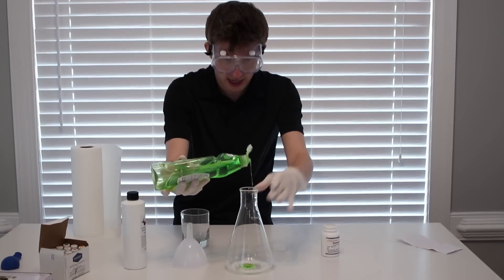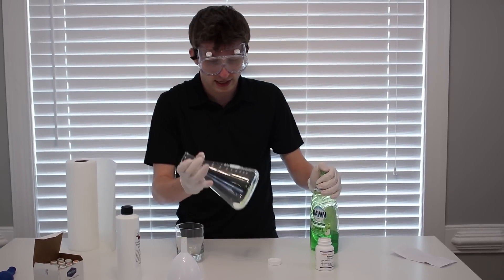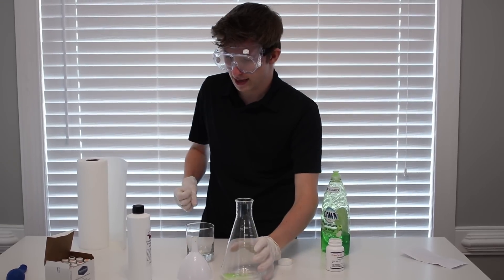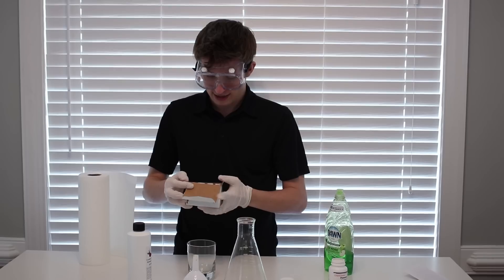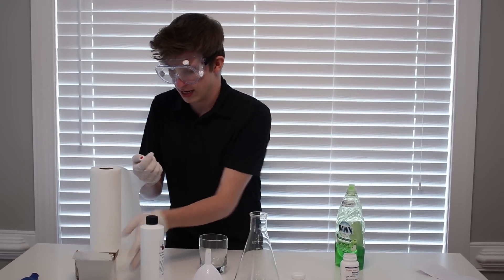I honestly don't know what this reaction is supposed to be. So there's the soap. Kind of mix that around, there we go. So that's all mixed in right there. And we're going to go ahead and add some food dye. Let's do green. No, let's do red. Let's do a nice vibrant red here, guys.